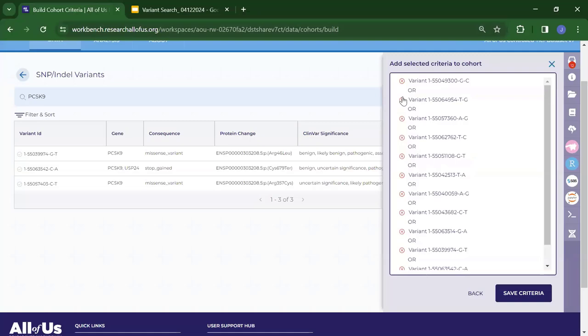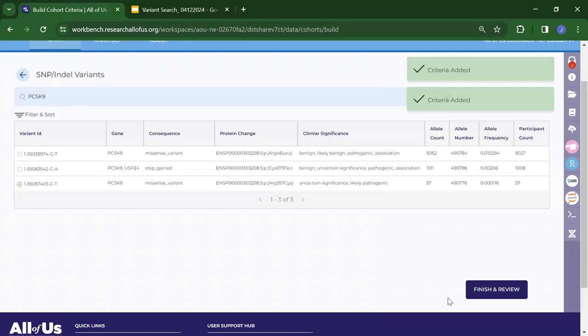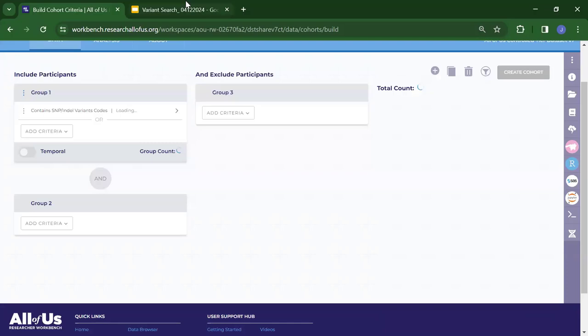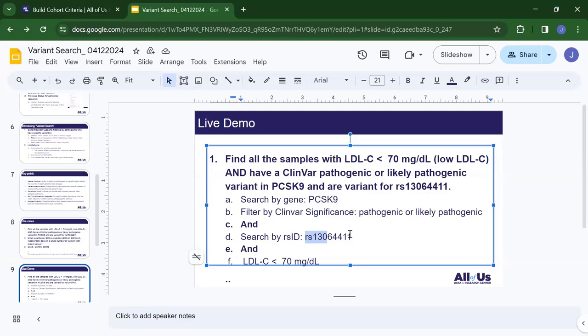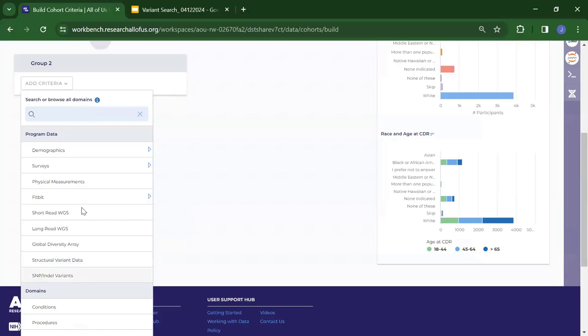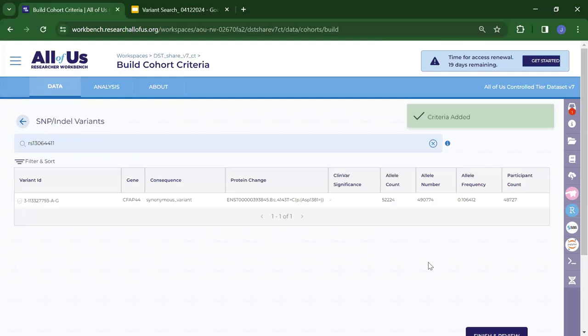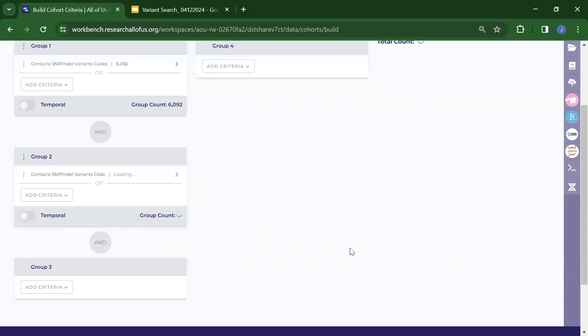I clear the previous selection, reselect these variants, finish and review, and save criteria. The next step is to search by RSID. I use 'AND' — as described in this use case — go to SNPs and indels variants, search for the RSID, select it, finish and review, and save criteria.